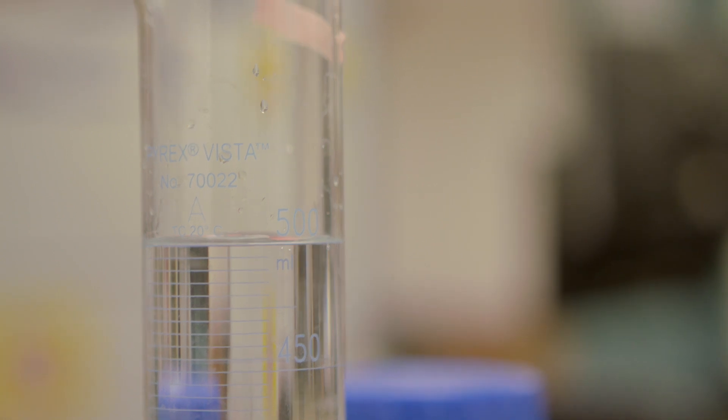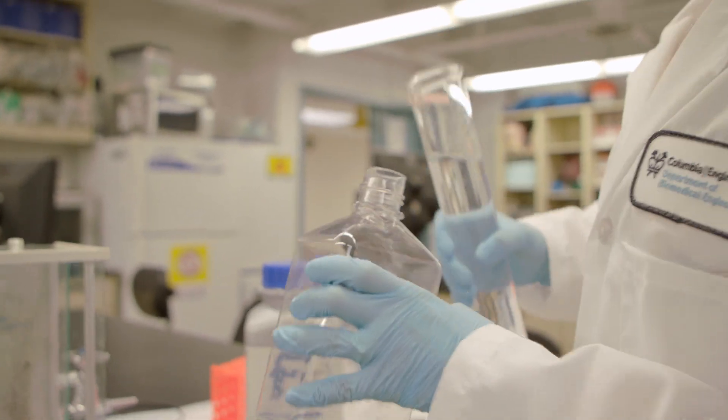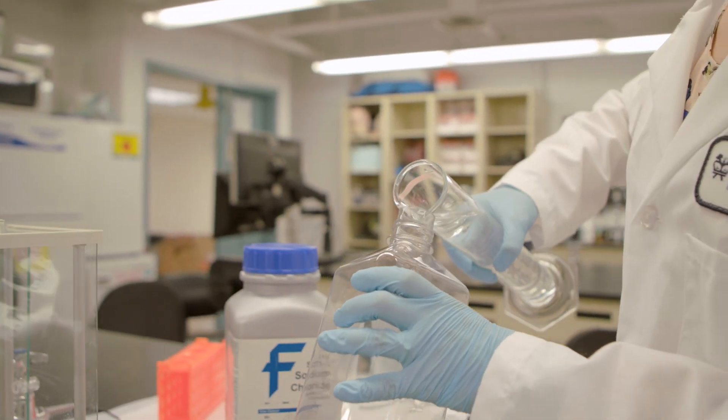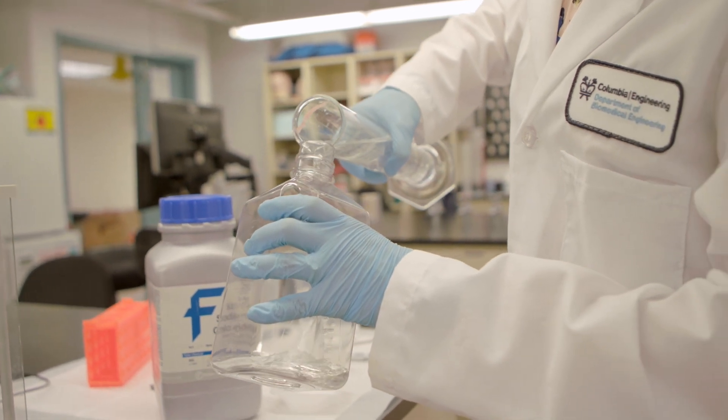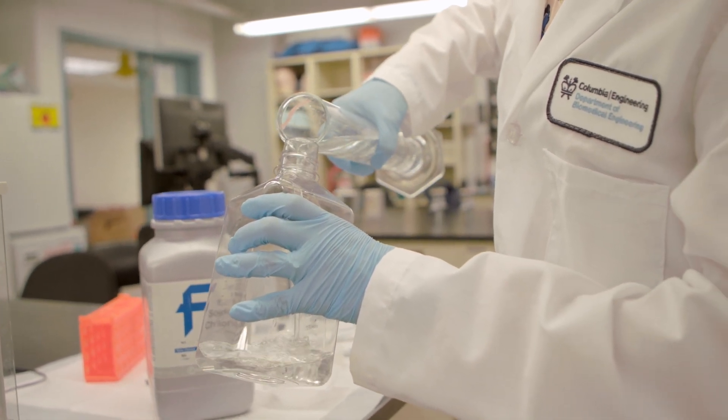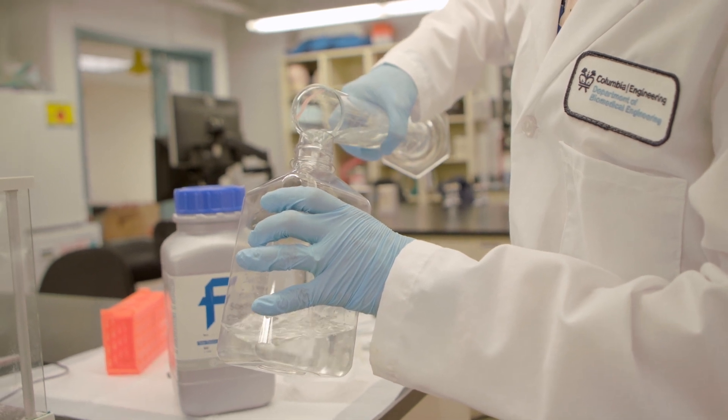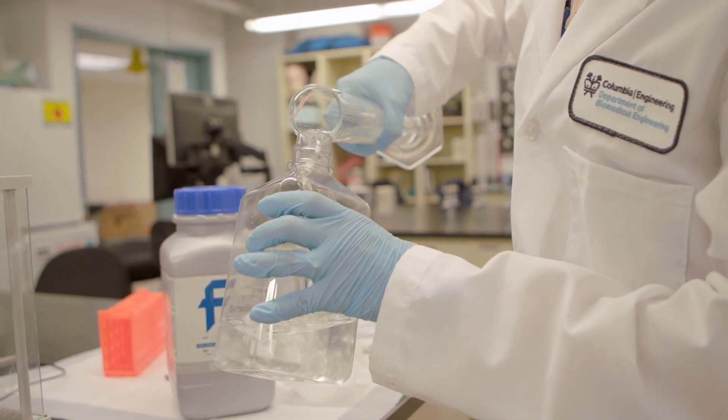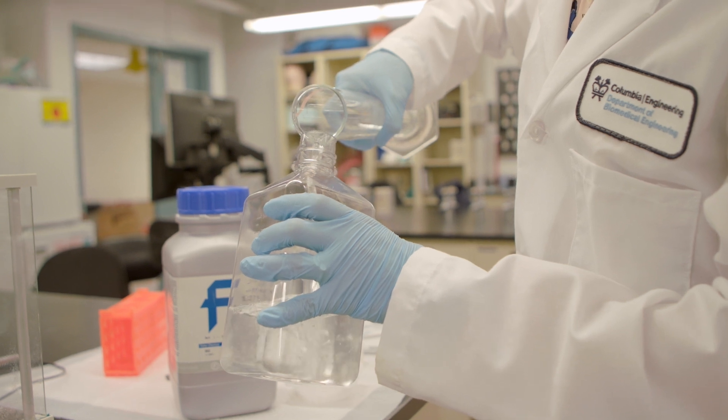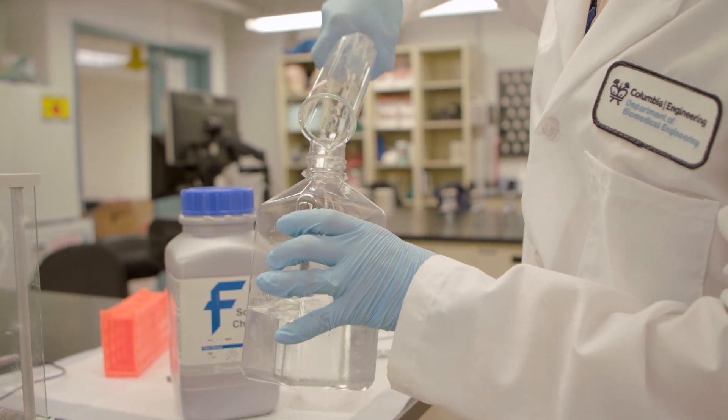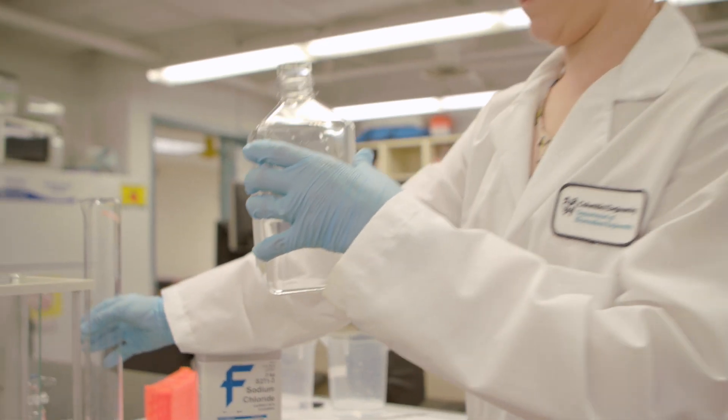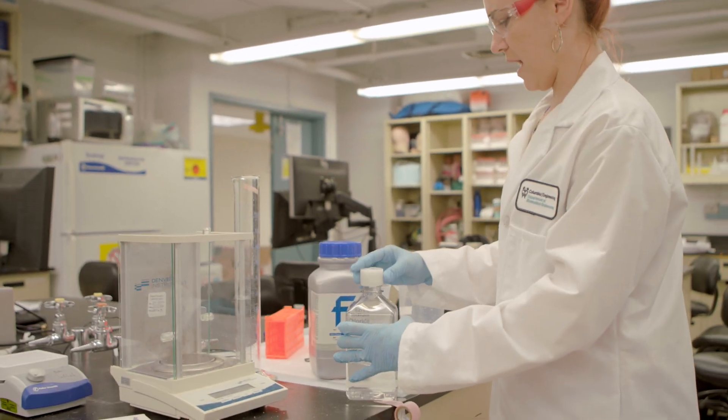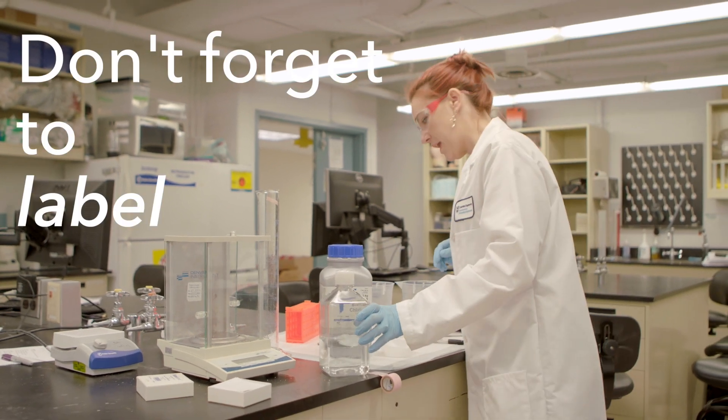So now I have 500 mils of my 10x solution. I can pour it into my storage jar. The trick with these graduated cylinders is to pour slow so you don't overflow and spill as you're pouring. Put that lid on.